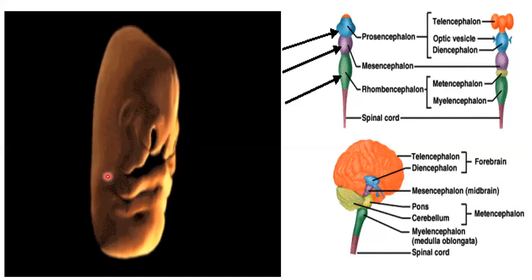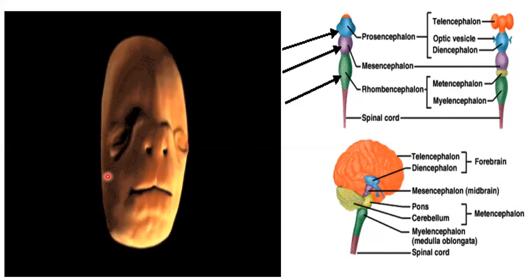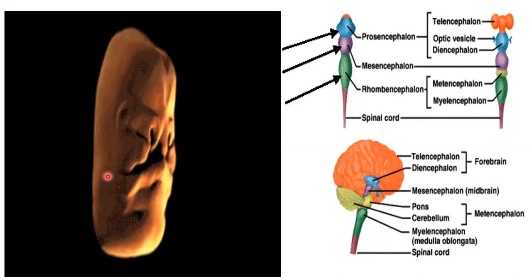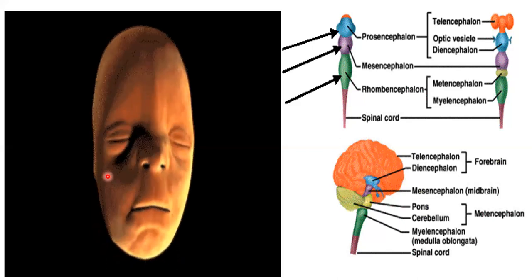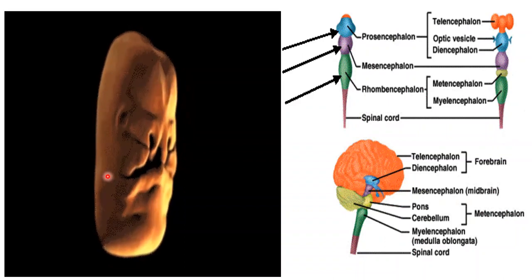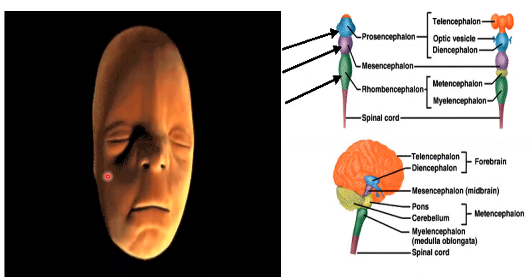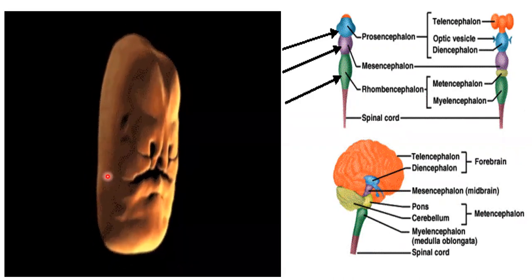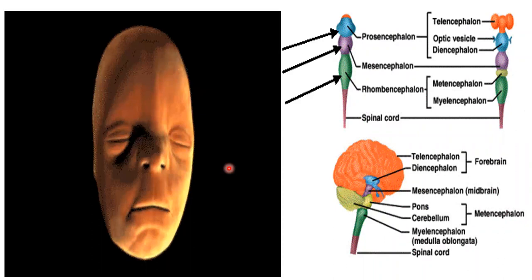But many neurological problems can be detected by studying the brain cells, or indirectly by taking a CSF sample, a cerebrospinal fluid sample. We can understand the broad range of neurological abnormalities contributing to the central nervous system, and all nervous system abnormalities and diseases can be effectively identified by studying the brain. Here in histopathology and immunohistochemistry, we will see the individual cellular structure and its cellular abnormalities from a histochemistry point of view. So that is the idea of this nervous cell demonstration.